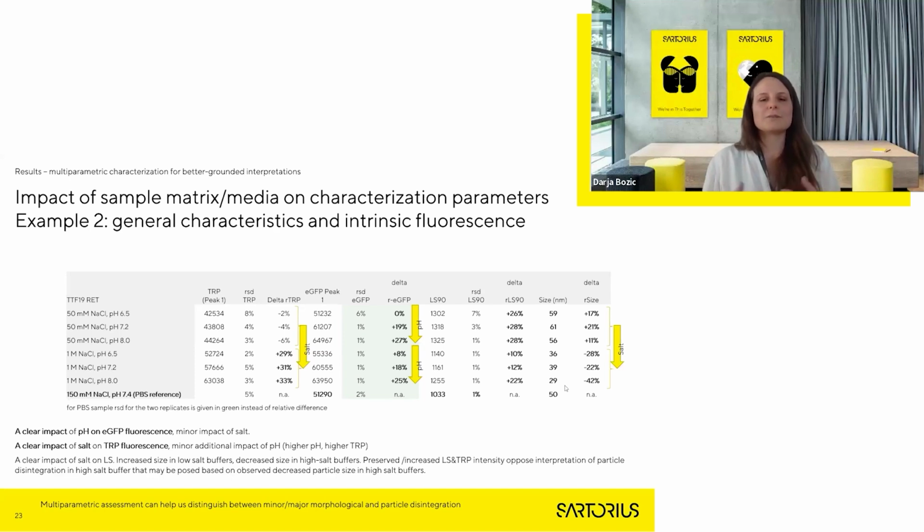The columns offered by Sartorius are good ones and can be applied to various samples, but it really depends on the samples. Methacrylate columns are applicable to a wide range of samples, so I don't see why not.